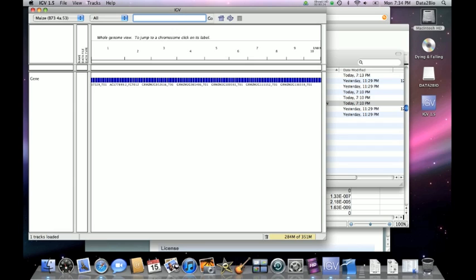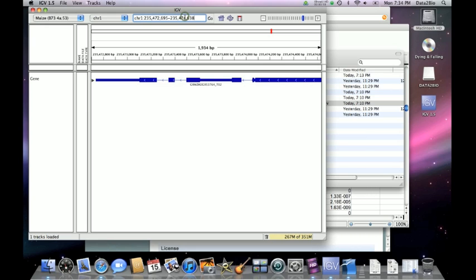zoom in on something we'd be more interested in, let's start by pasting in a relatively random gene name. And I'm going to actually make this a transcript ID because, as you can see here, the names of the genes as they are loaded into the browser are in fact transcript IDs. This will vary depending on what your organism is. Just make sure that you're entering your gene name in the same format as is displayed down here at the bottom.